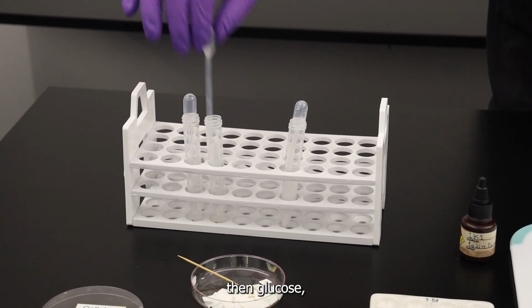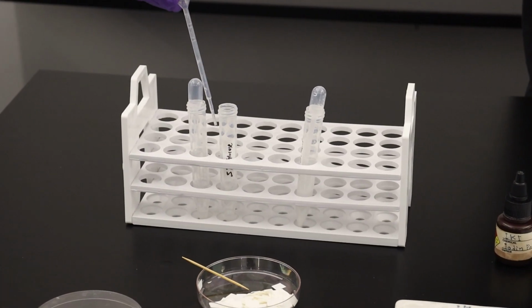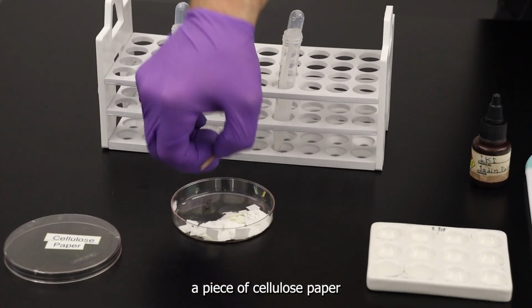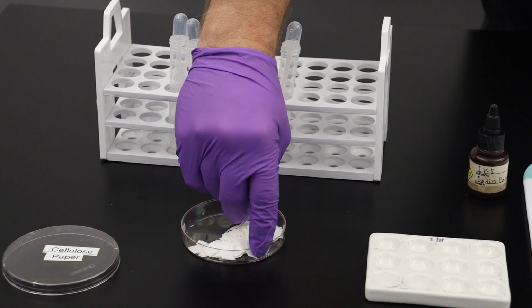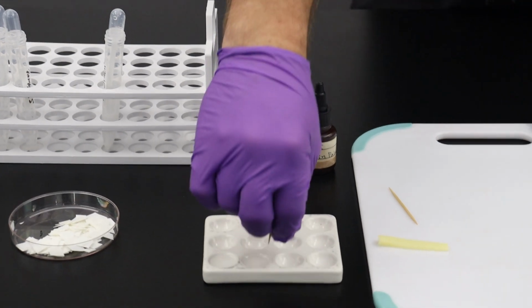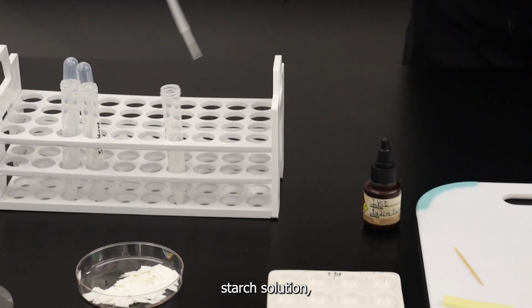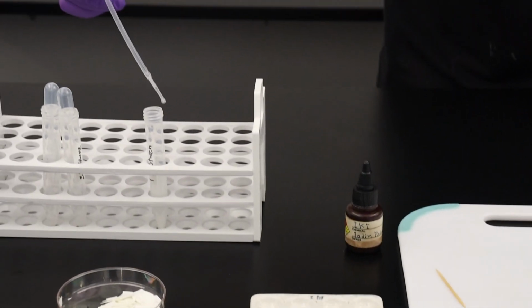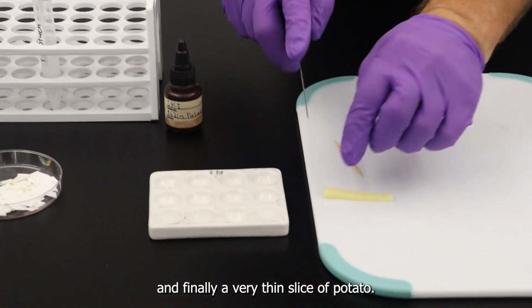Then glucose, a piece of cellulose paper, starch solution, and finally, a very thin slice of potato.